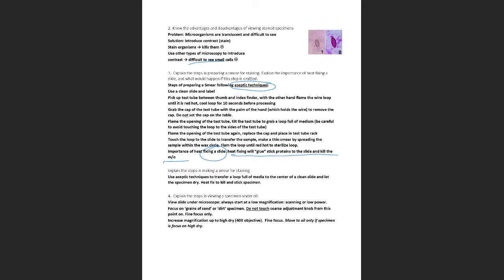Okay. So when we look at the specimen under oil, we always use the 100X. We don't want to use the 40X under oil because that is going to ruin the 40X objective. And the shape and arrangement of bacteria. And we are going to go into other labs like the Gram stain lab, in which we'll look at slides and see what the Gram reaction and arrangement are, and so we'll go over those.